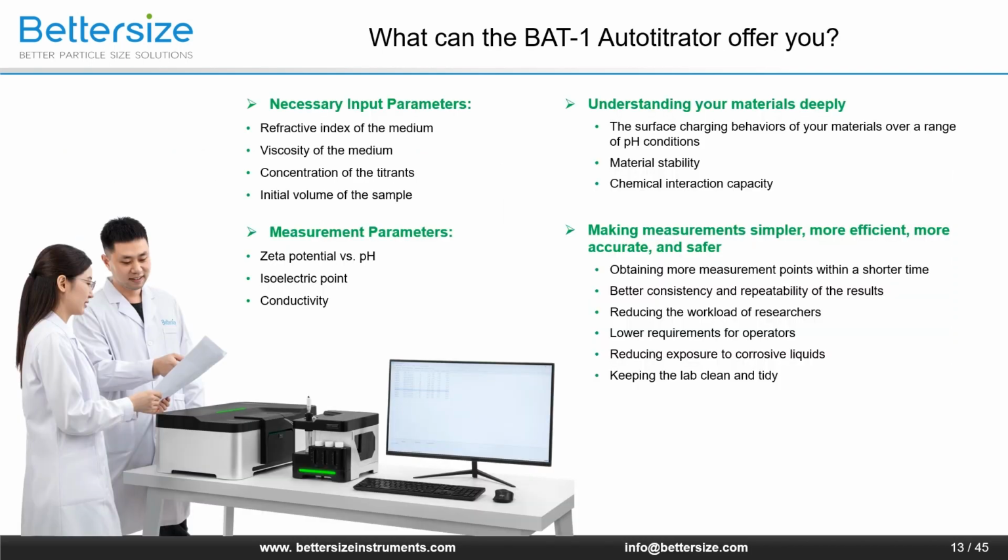The required input parameters in the SOP are refractive index and viscosity of the medium, concentration of the titrants, and the initial volume of the sample. And after the test, you will get zeta potential as a function of pH, the IEP, and conductivity.